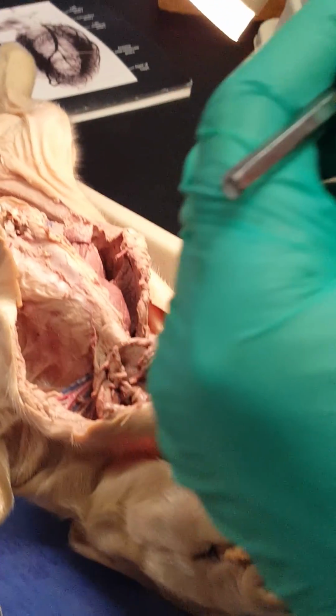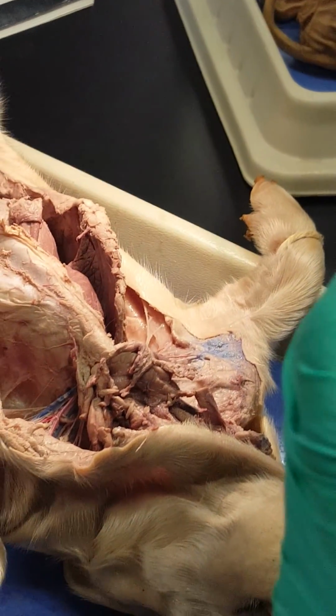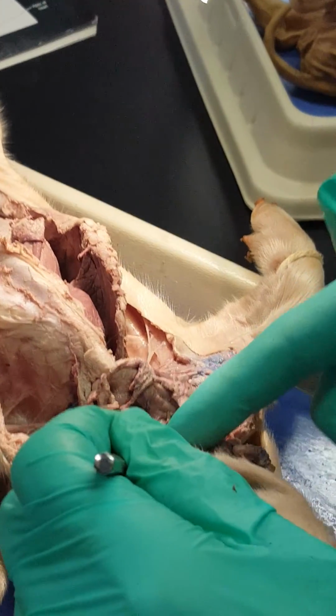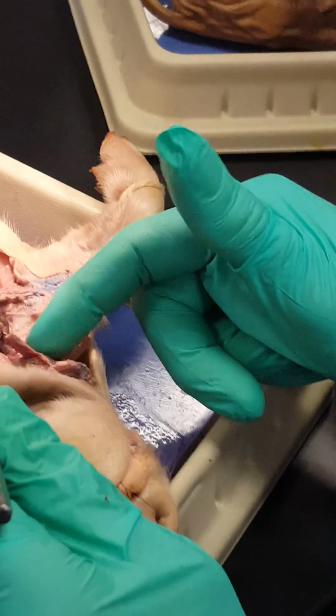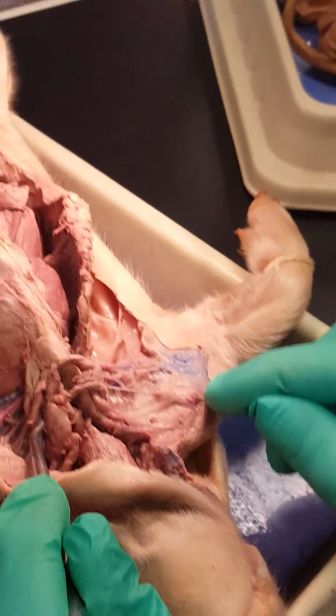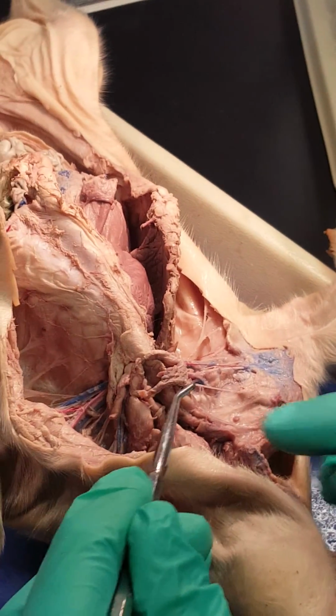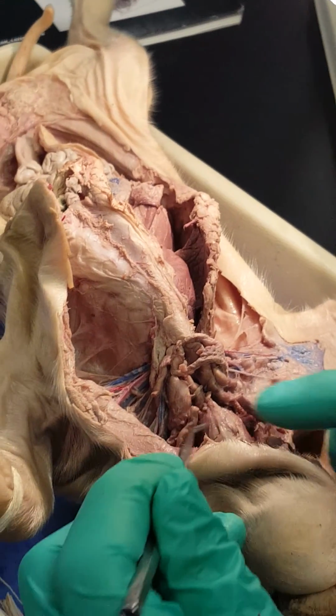So is that a lot more superficial than in humans? The carotid seems like it's pretty deep. You can palpate it if you reach around the trachea here. Yeah, it seems like they have more neck muscle around it here than we do. But it's not as superficial as the jugular. Yeah. Right.